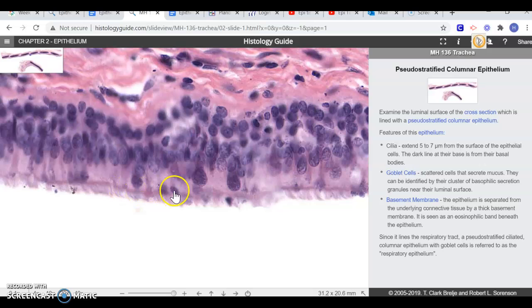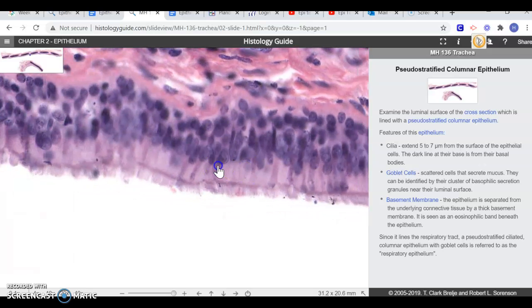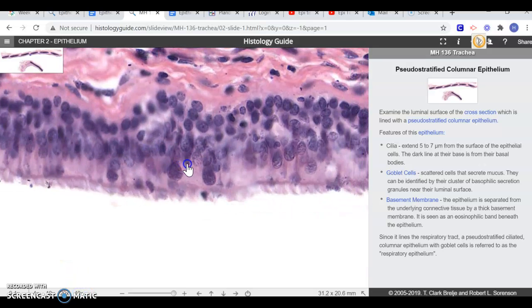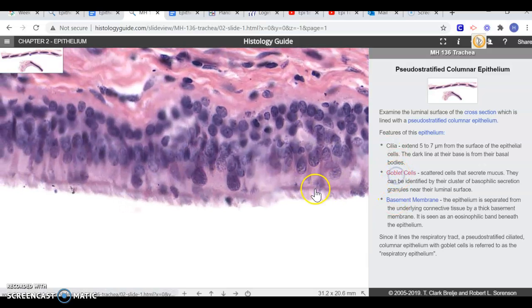And then it looks pretty unclear, but this is pointing to, or sorry, this that's with the apical surface, it's like it's flipped upside down. But this is the cilia, and we can scroll along, so definitely feel free to do that. Move around to try to see what you want to see, and I would zoom in all the way to 40, which is basically where we're at. But like I said, when you click on these different things, it should show you those particulars.